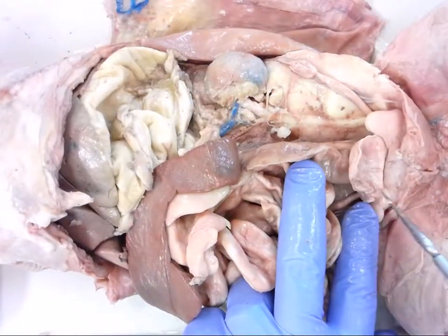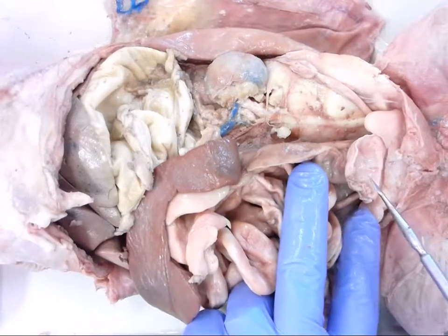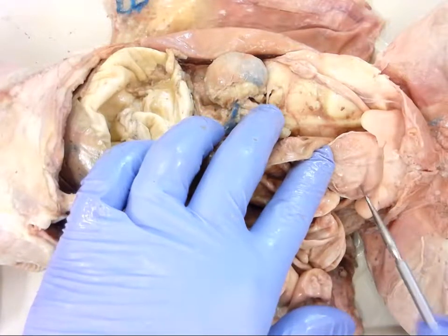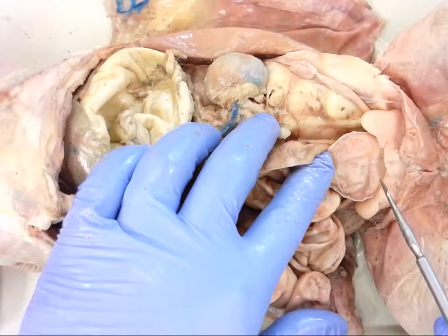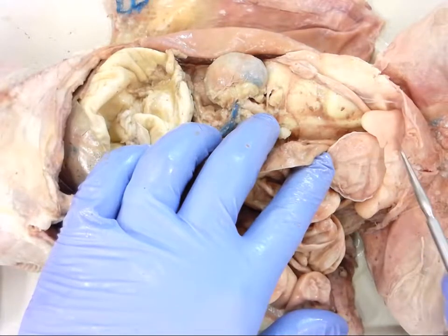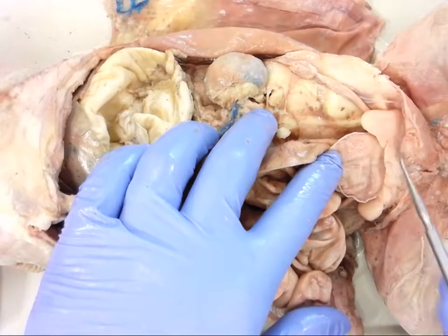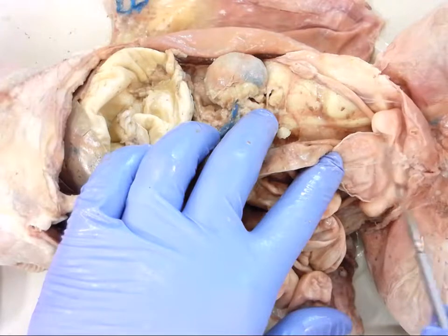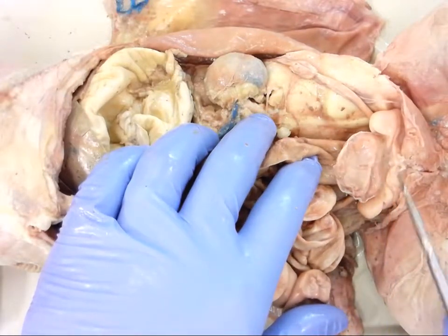This is the urinary bladder, where urine is stored until it's stimulated to be released. We relax the internal and external sphincters, and then urination occurs. This extra tissue here is some fat. This is a female cat, so we often find a little more abdominal fat there as well. But this round structure is the urinary bladder.